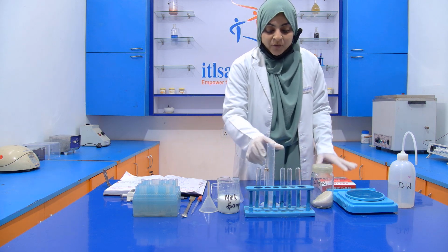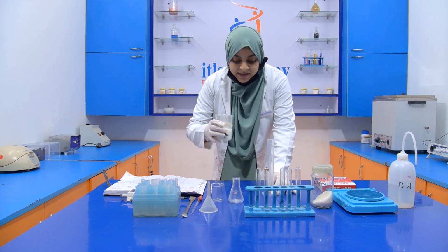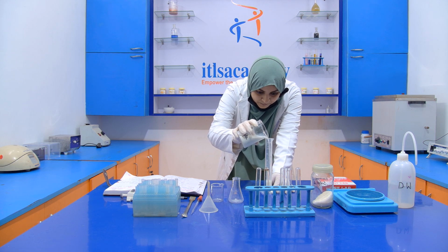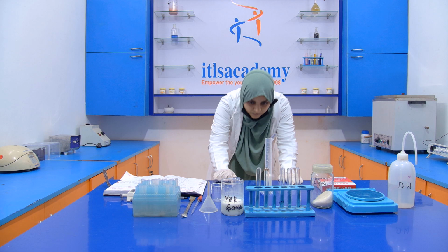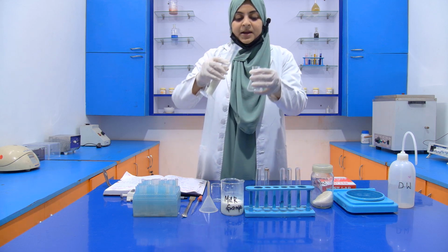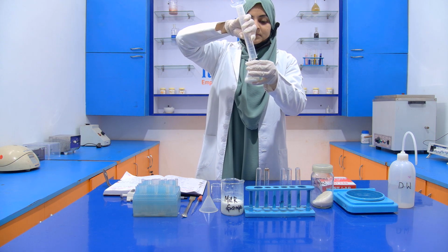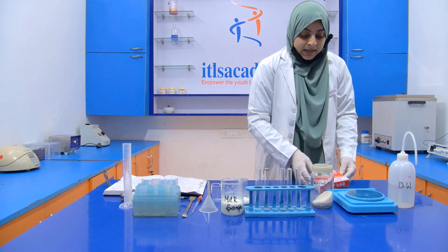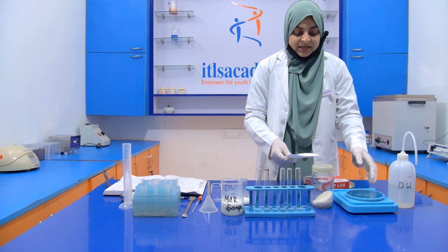First of all, we have to take 20 ml of milk. Now this milk is taken with the help of the measuring cylinder. Now I am transferring this milk into a conical flask like this. After that, we have to take 4 grams of this ammonium sulfate.